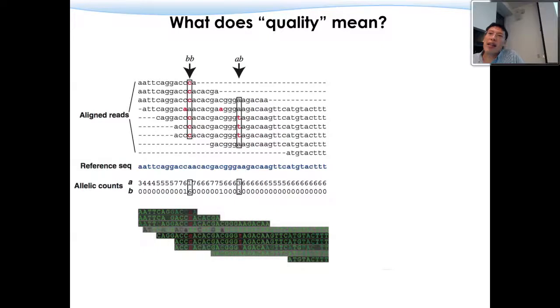Okay, so if you got an experiment you did in our core, and then you ask me a question, is my data good? I really don't know how to answer your question because there are many different levels we can look at. I'm giving you a very simplified version, which is on the DNA sequencing.